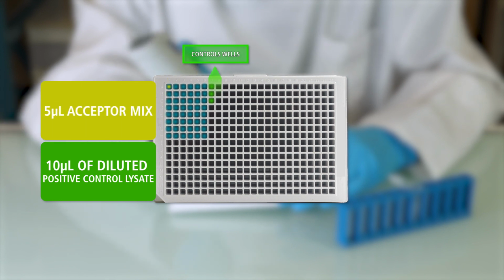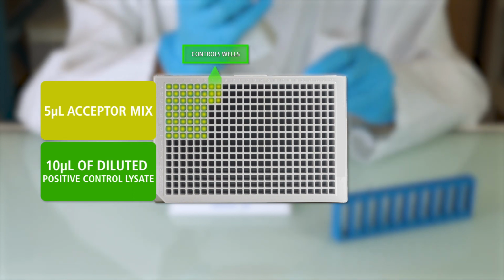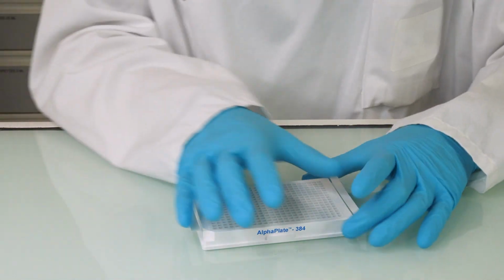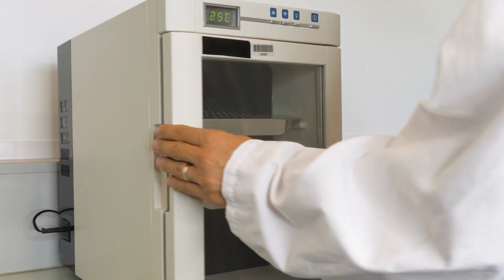To start the immunoassay, add 5 microliters of acceptor mix on top of the cell lysate. Seal the plate and incubate for at least 1 hour at room temperature.